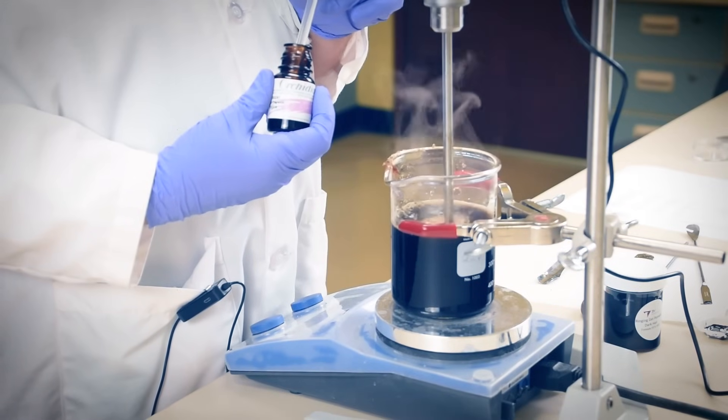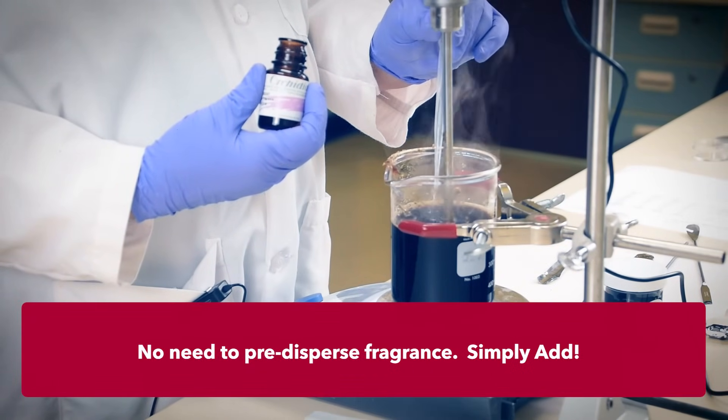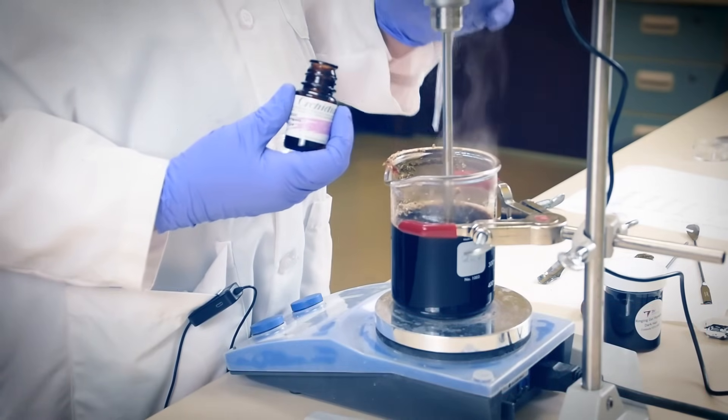Now we'll add the CT25 and allow time for melting and dispersion as before. We now have a uniform solution at 80 degrees Celsius, and we'll add the fragrance. A thermally stable one — with all that surfactant in there, solubilizing the fragrance is a cinch.